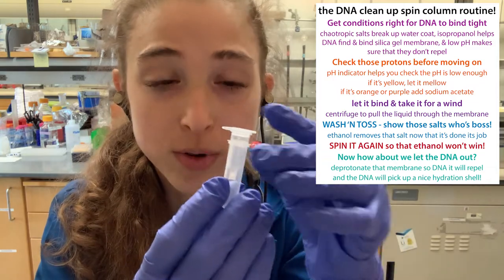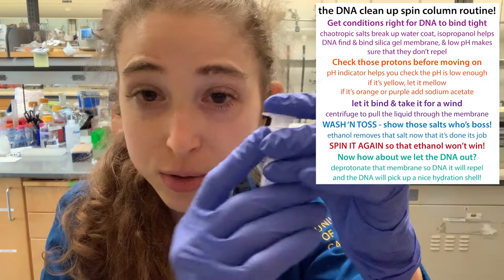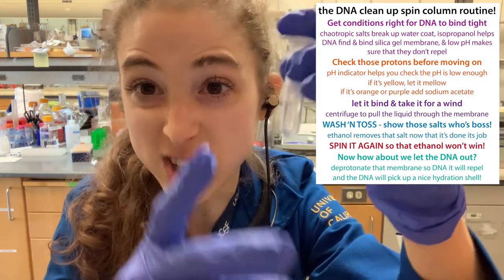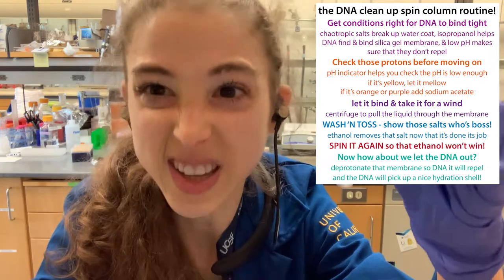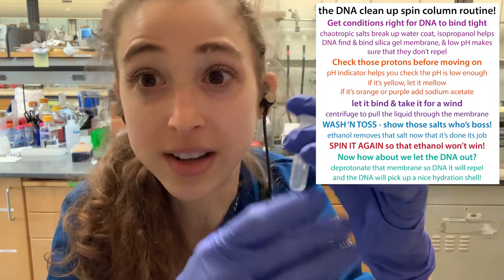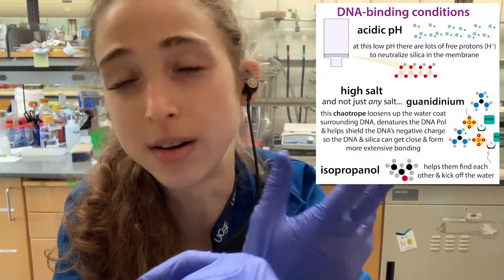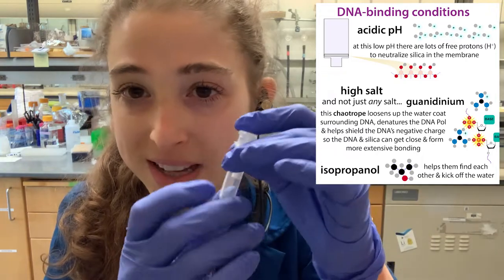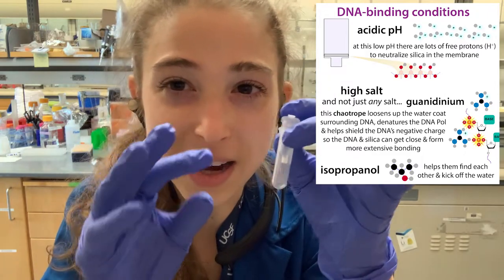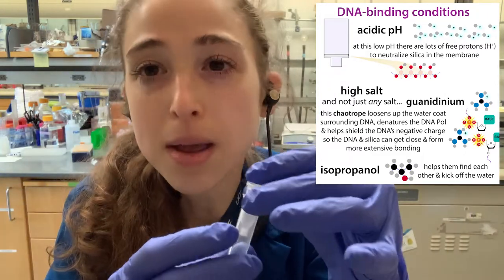Basically how these columns work is you have conditions where you get the DNA or the RNA to bind to this little membrane, then wash everything else out, and then elute it — add something that'll make the DNA or RNA dissolve off the membrane. There are more details in other posts, but it's typically a silica-based method where you're manipulating the pH, salts, isopropanol, and all that stuff.